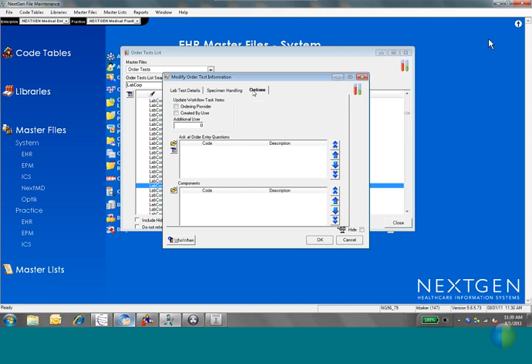And your final tab is going to take us into a couple other tables. But first of all, you're going to skip the updated workflow task items. That particular piece is not being used anymore either. But the sections for ask at order entry questions and components may be used. Before I go into those, I want to recap really quick.